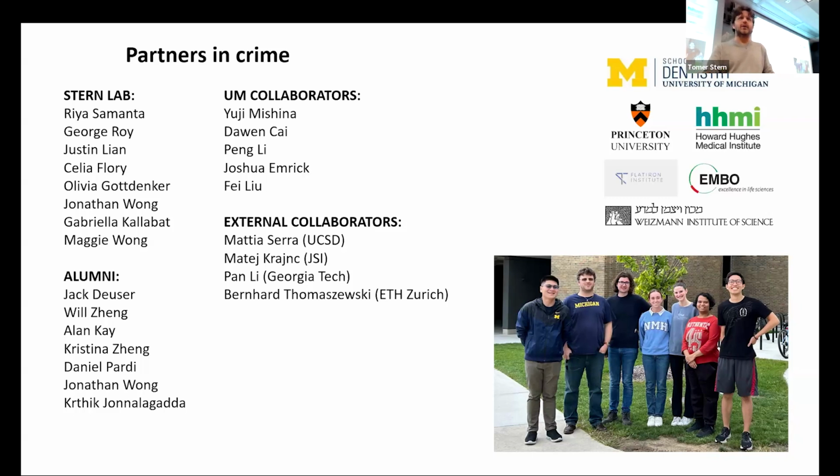We're developing an algorithm that automatically identifies errors. We take the results of CellPose specifically, and we developed an algorithm that identifies and automatically corrects the errors of CellPose in segmentation and tracking. So we're kind of generating a boss that looks over the work. And yes, hybrid approaches, where you utilize these different approaches to help you zoom in on better structure that you can measure with some kind of figure of error.